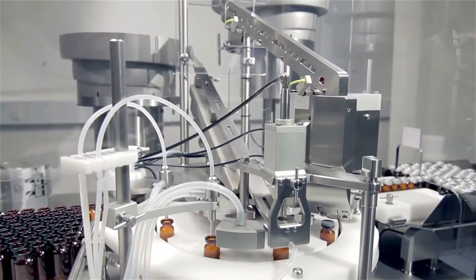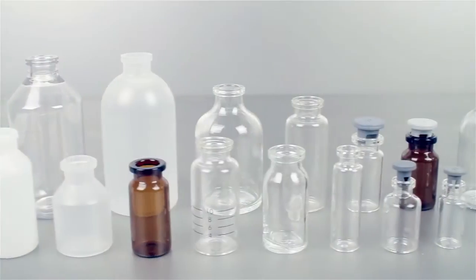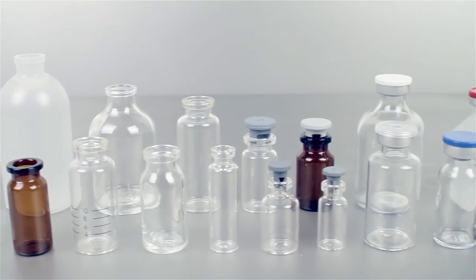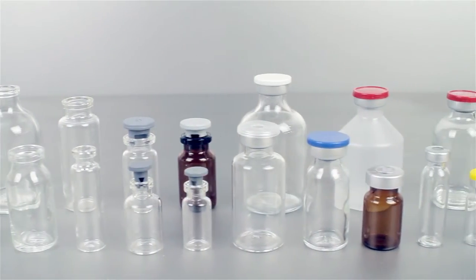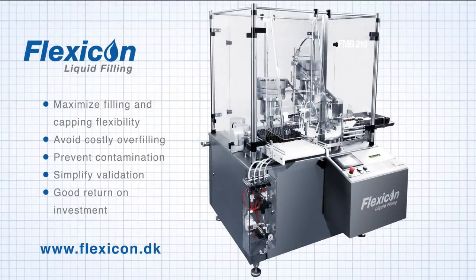Our automatic filling and capping systems have been installed in more than 37 countries, serving the diagnostic, biotech and pharmaceutical industries. The systems are extremely reliable, deliver improved flexibility, reduced production costs, minimum risk of leaking containers, less costly overfilling and a more efficient validation process.